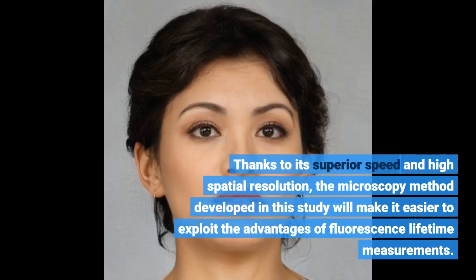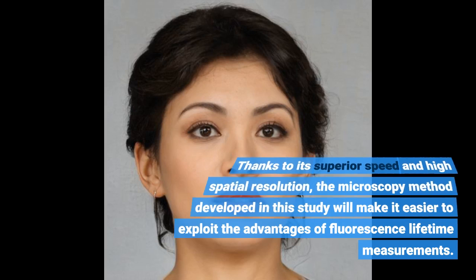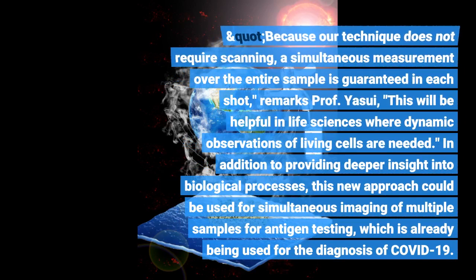Thanks to its superior speed and high spatial resolution, the microscopy method developed in this study will make it easier to exploit the advantages of fluorescence lifetime measurements. "Because our technique does not require scanning, a simultaneous measurement over the entire sample is guaranteed in each shot," remarks Professor Yasui. This will be helpful in life sciences where dynamic observations of living cells are needed, in addition to providing deeper insight into biology.